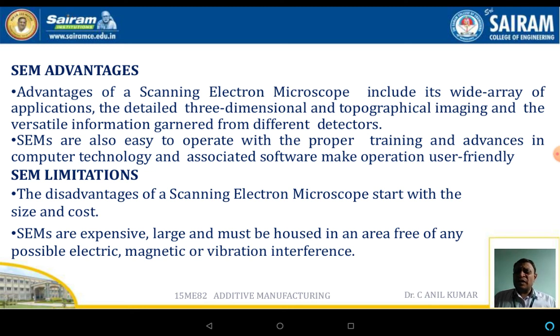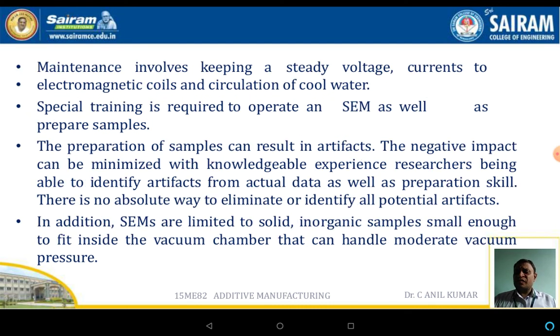The main SEM limitations are size as well as cost. Another disadvantage with respect to the SEM is that it is very expensive and large and must be housed in an area free from dirt and even electric, magnetic and vibration interference.